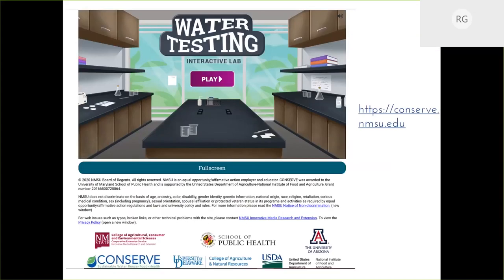And as a companion to the water sampling virtual lab, the New Mexico State University team also created a water testing interactive lab. And what this does is it shows you step by step exactly what happens in that lab. So you can go through this and you can see from the moment that it reaches the lab how you process the water samples and then how you actually count the bacteria that are on those different plates.